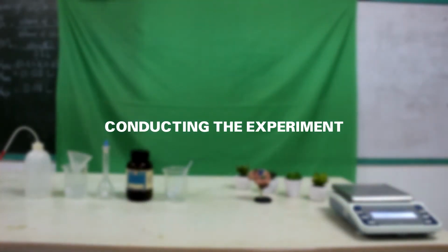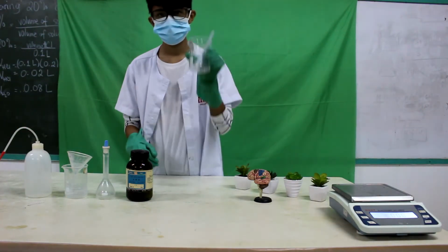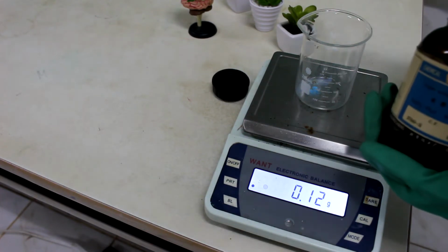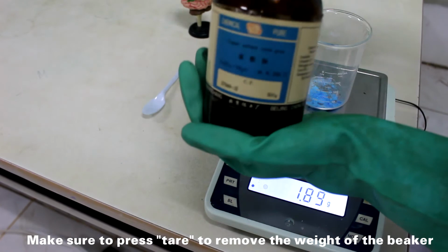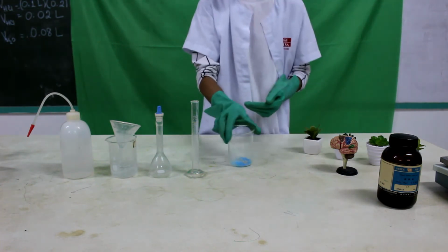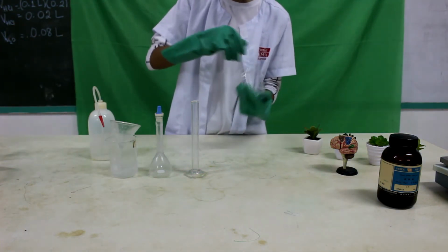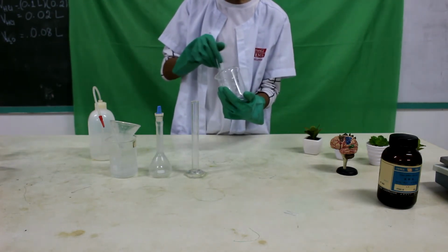Here are the materials needed for the experiment. First is we weigh 1.91 grams of copper 2 sulfate in a weighing scale. Dissolve the copper 2 sulfate in water. Stir it with stirring rod until the solution is homogenized.